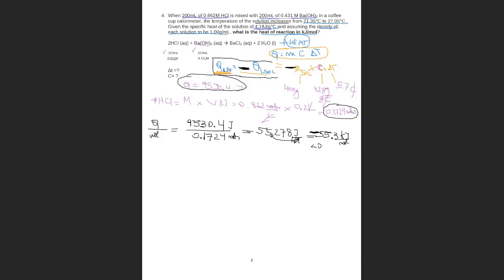That's why we needed that minus, actually. The solution increases from 21 to 27, which means that the solution absorbs energy, which means that the reaction lost energy.